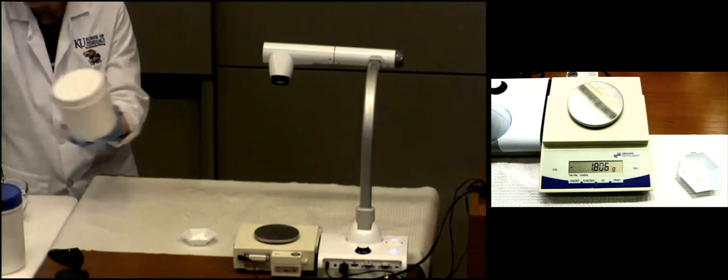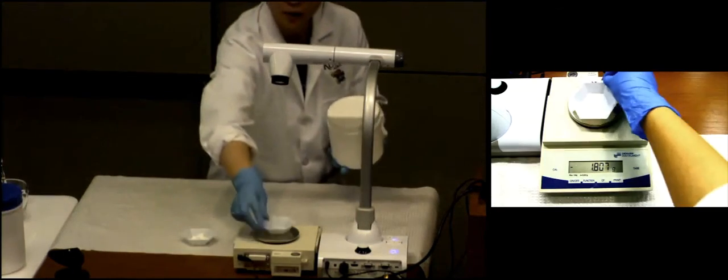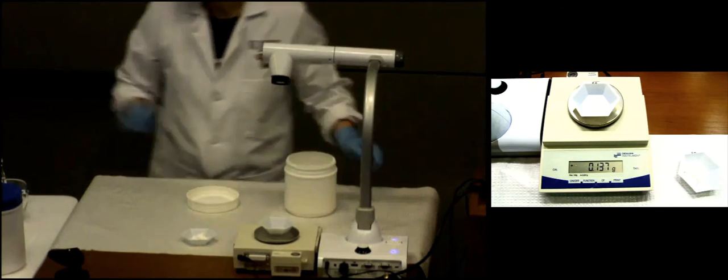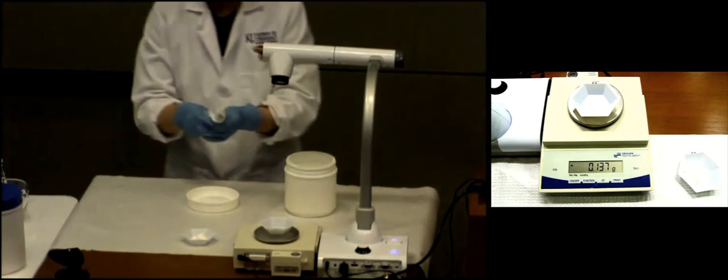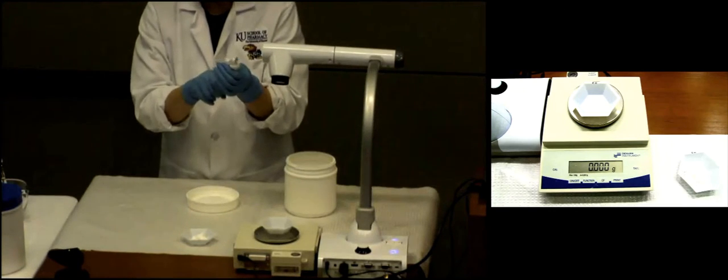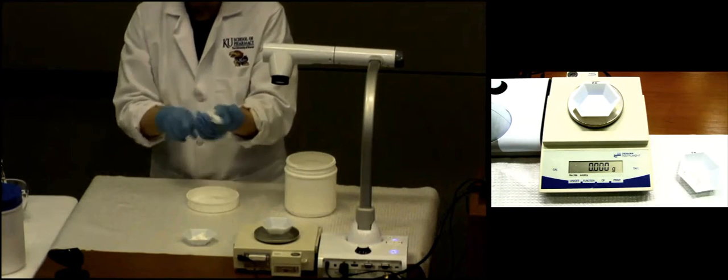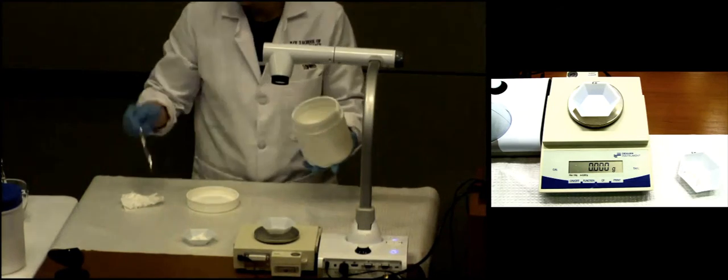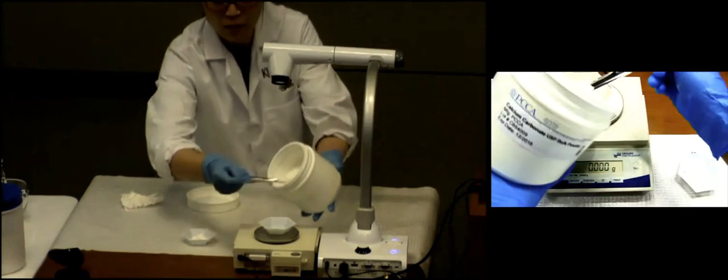Okay, the next powder I'm measuring is calcium carbonate. I tared with a weigh boat, but because the weigh boats have different weights, I have to tare again. Also, I have only one scooper, and you have one as well, so you never want to dip a dirty one into a different chemical bottle. So clean it, and then measure again.